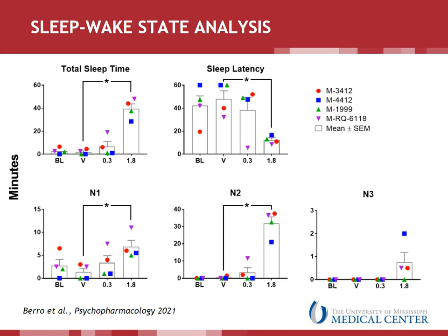and this is also in agreement with findings in humans showing that benzodiazepines tend to suppress N3 or slow wave sleep and also REM sleep, and that's likely why we didn't see significant increases in these 2 sleep stages in our recordings, especially because they were daytime recordings.